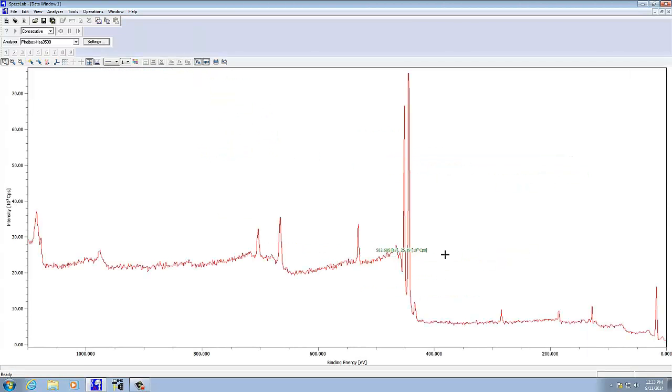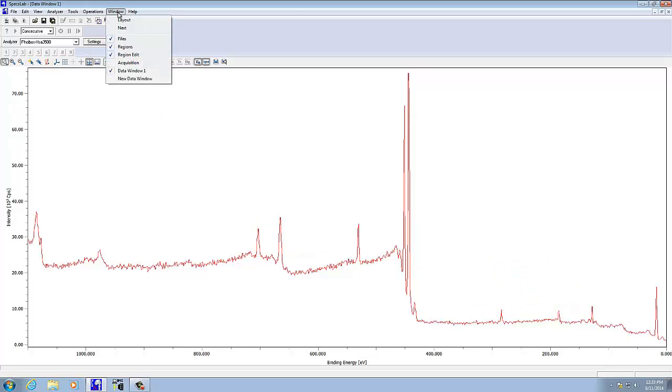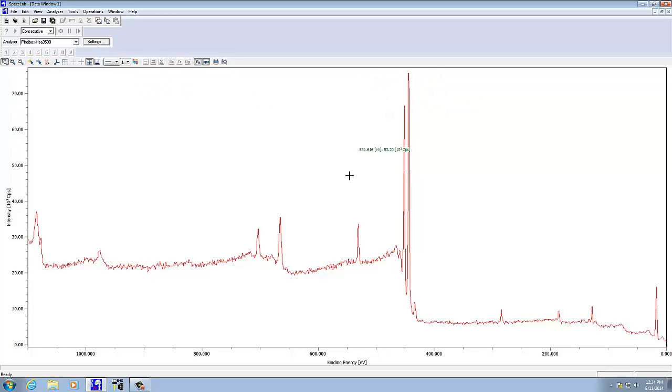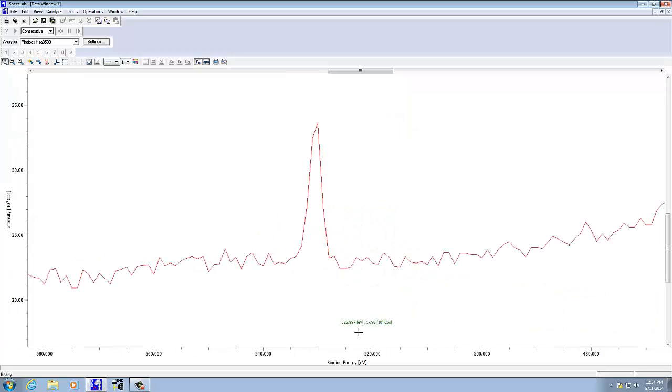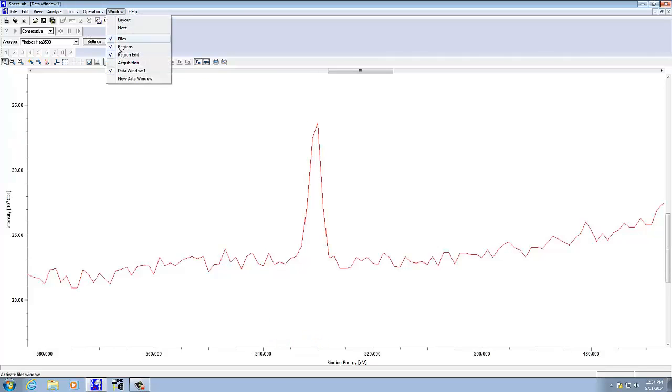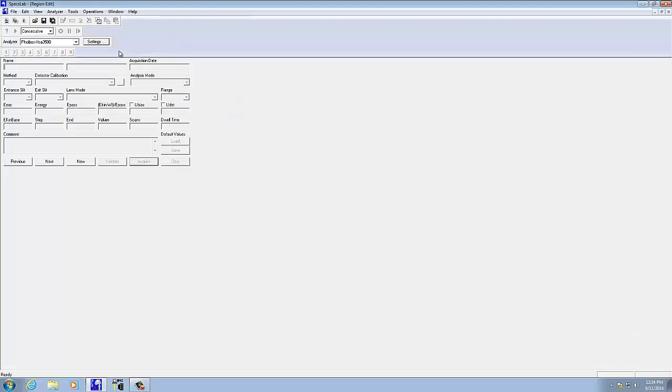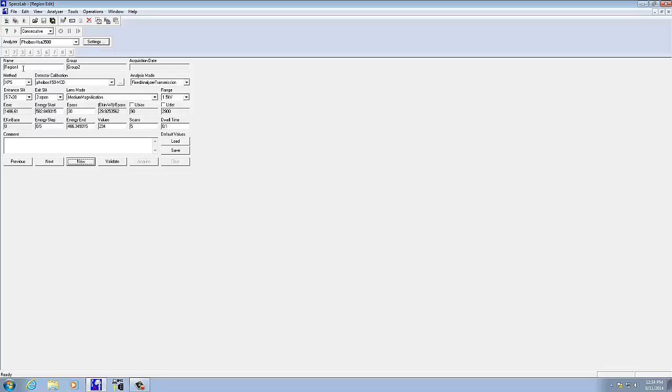If you want to do a narrower scan, all we have to do is go back. Let's say we wanted to look at this peak here in a little more detail, so about 520 to 540, for example. What we could do then is go to regions, edit.